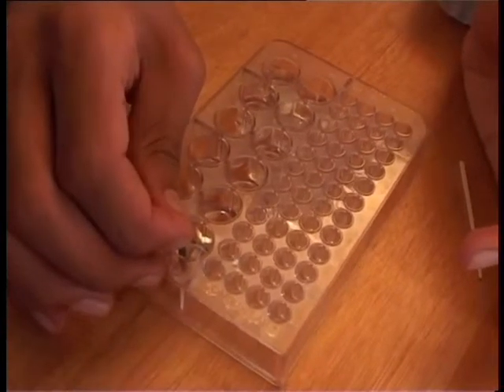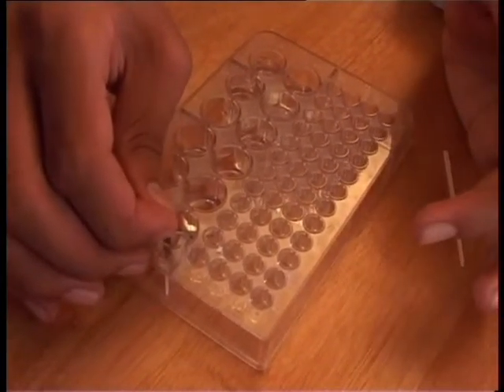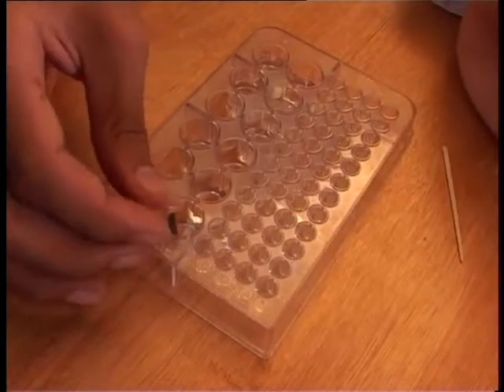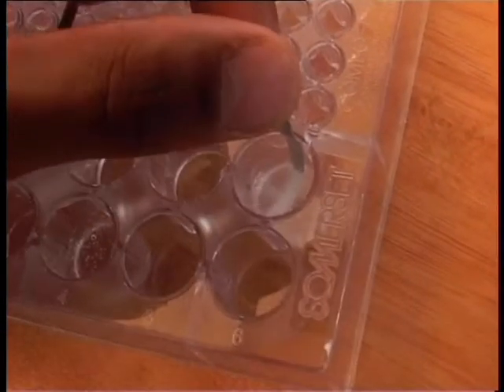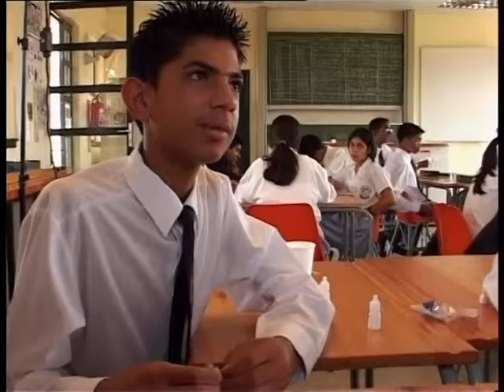Next, magnesium is put into the same substance. We observed that with magnesium and substance D, there is no reaction. Did you clean your magnesium with sandpaper? After being sanded down, the magnesium is again put into the solution. Bubbles are forming and there is a smell. This tells us that when we mix magnesium with substance D, a gas is produced.